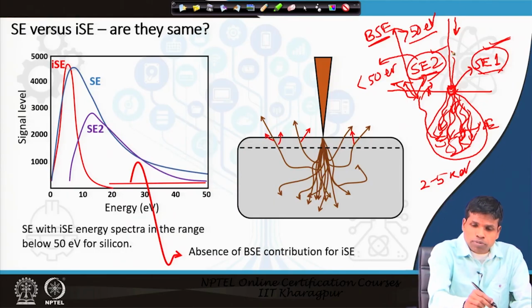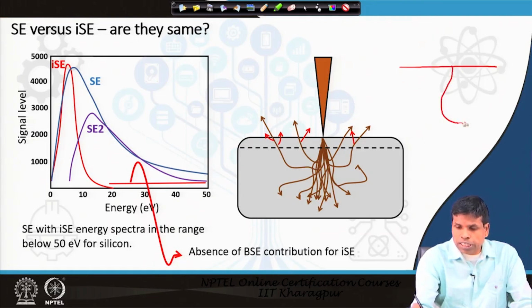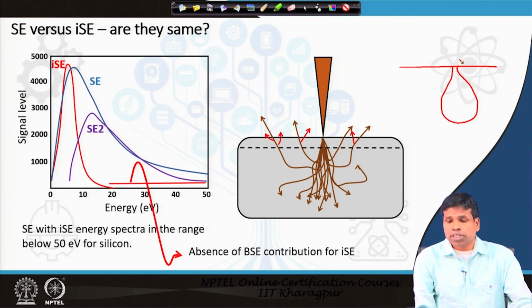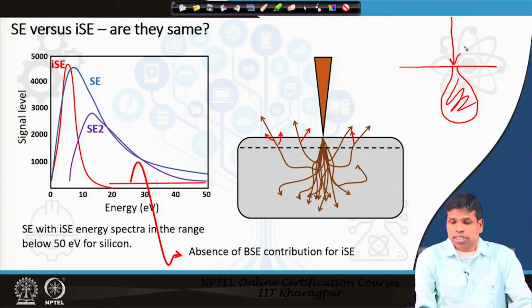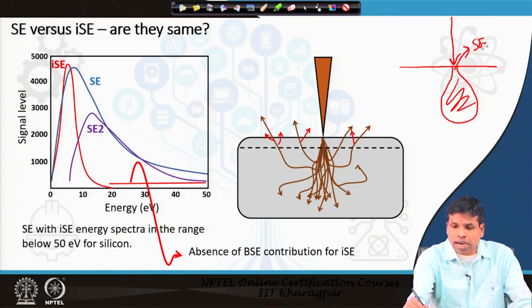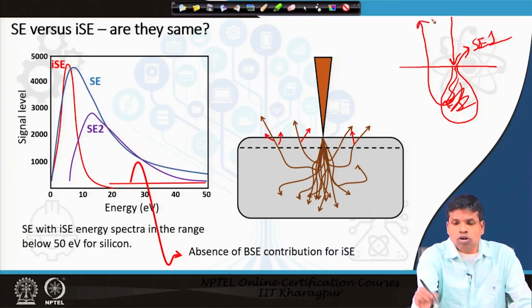On the other hand, if we look at the ion microscope, helium ion microscope, again we have the same type of interaction volume, but this area is certainly smaller compared to electrons, and when an incident ion falls on the specimen, more SE1 are generated. Why? The ions come and interact, and they lose energy, and they have less chance to come out. Recoil will be more.